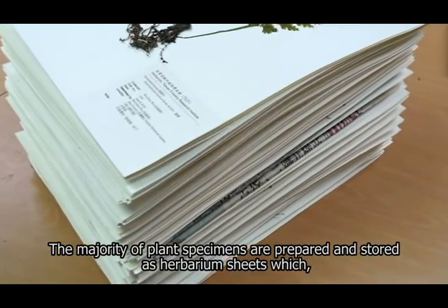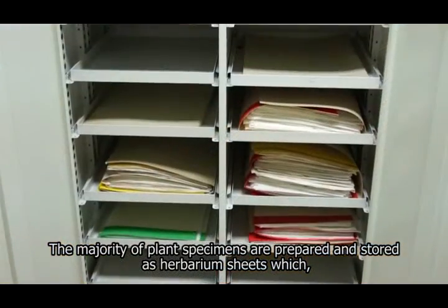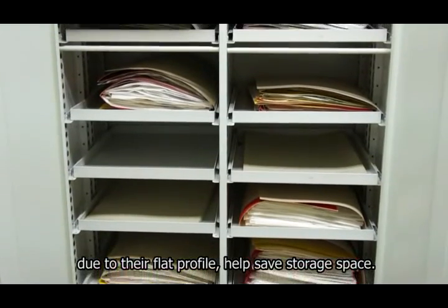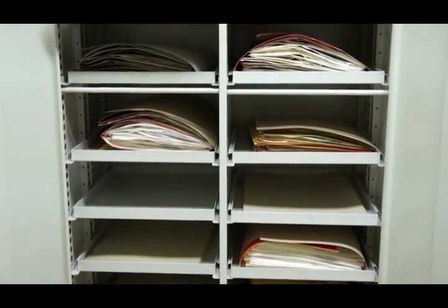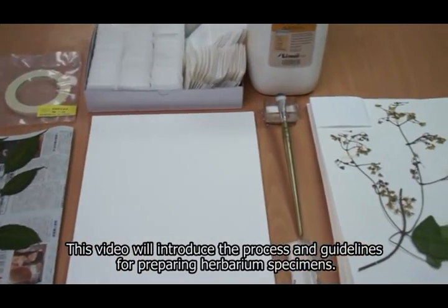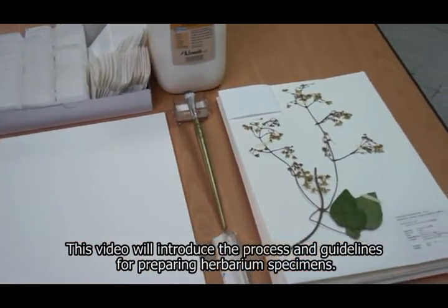The majority of plant specimens are prepared and stored as herbarium sheets, which, due to their flat profile, help save storage space. This video will introduce the process and guidelines for preparing herbarium specimens.